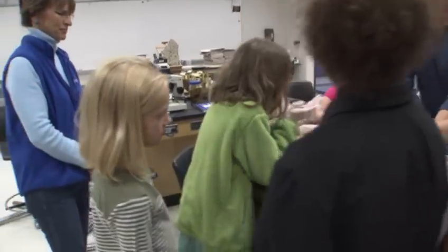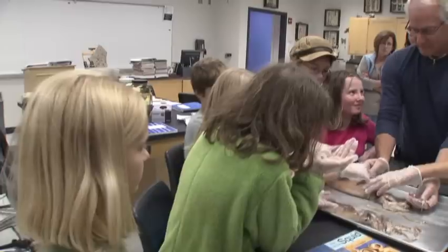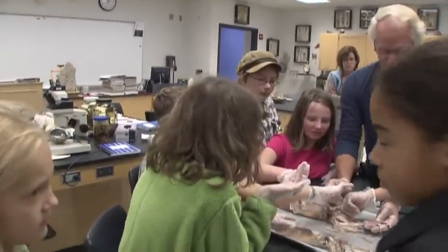Remember, mollusk is like a soft body, right? And the eyeball, we're going to pop the eyeball, right? Okay. We're going to take the lens out.